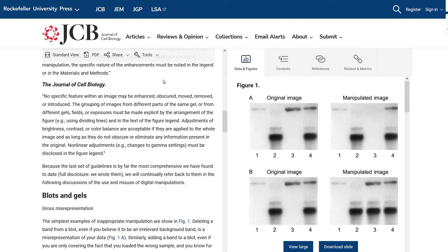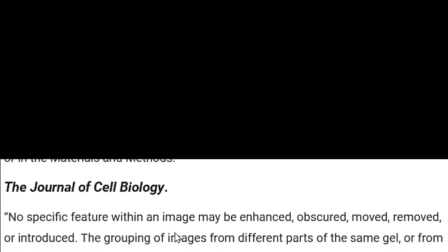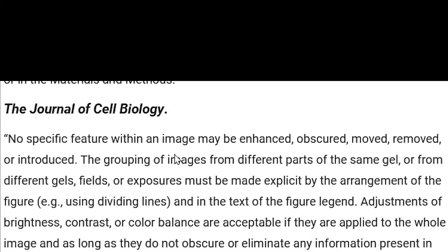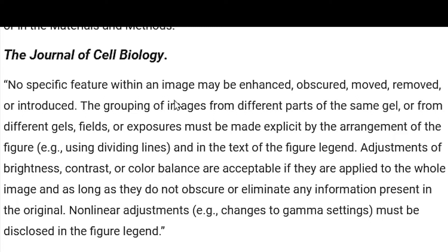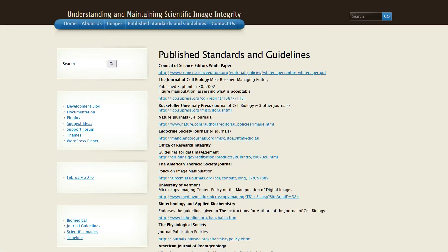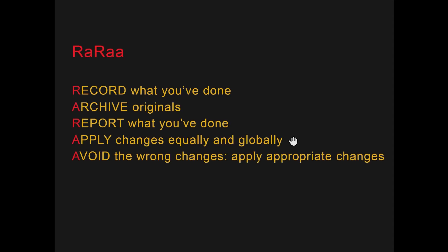Looking at the one paragraph of this article often cited for image integrity, you'll find that the Journal of Cell Biology includes a key statement. Other published standards also include additional parts of the list. So here they are — RARA: Record what you've done, archive originals, report what you've done, apply changes equally and globally, avoid the wrong changes, and apply only appropriate changes.